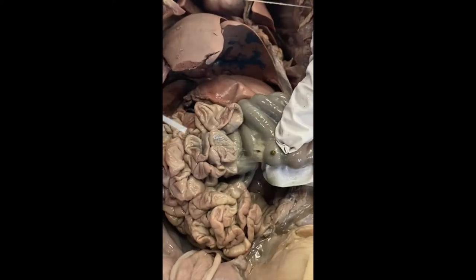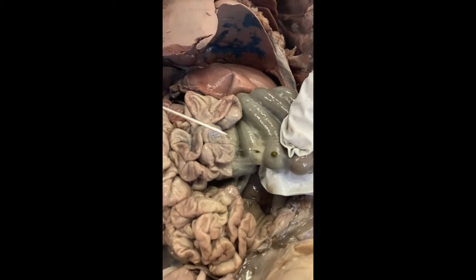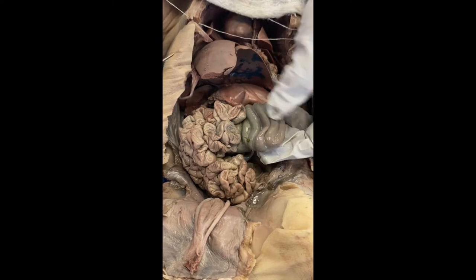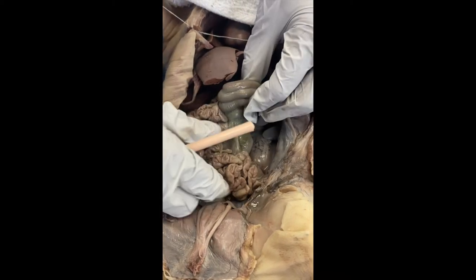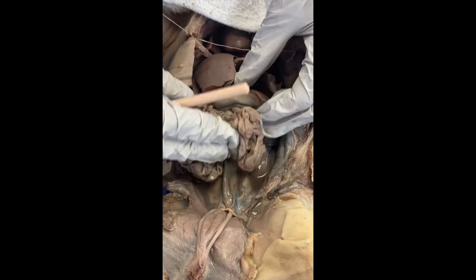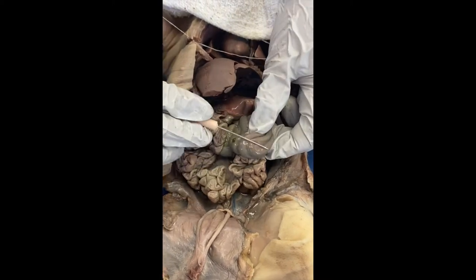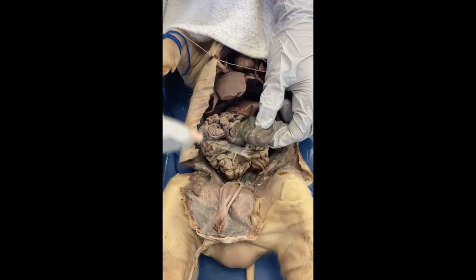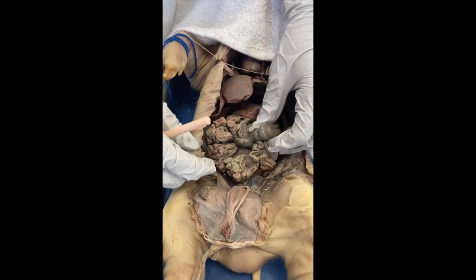You know it. Okay, so at this point we're really getting it ready for waste, water, those things are important. And also some things that you weren't able to digest, we have bacteria in here to try and help with that as it gets finally on its way out.